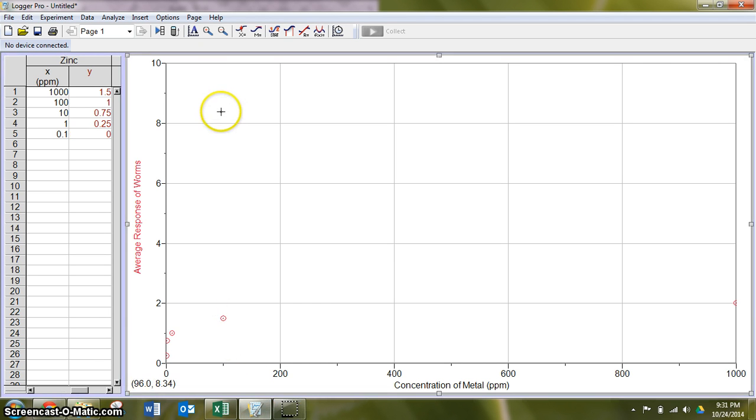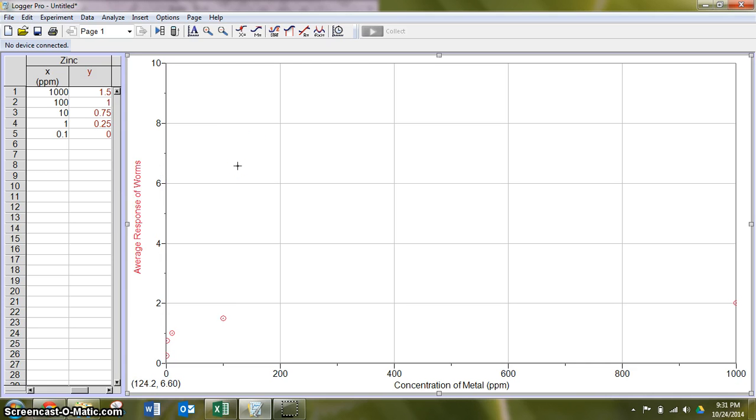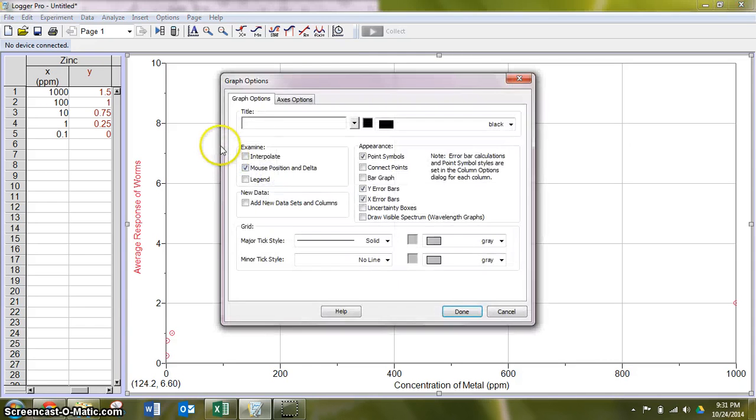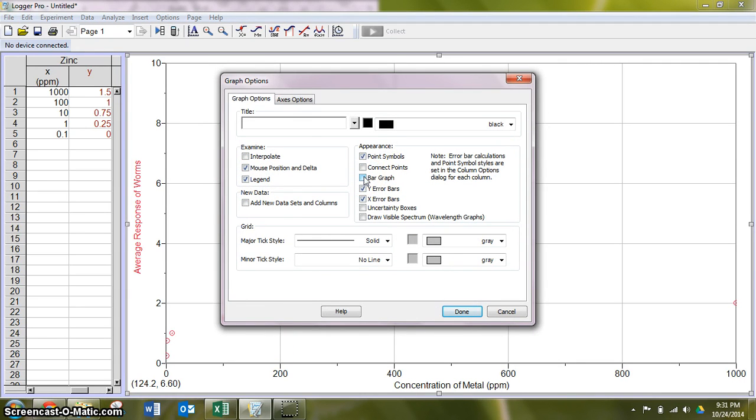Now, we want to go in and make a lot of our adjustments. Notice I put these in first, so we'll be able to do a lot of our button clicking. Right-click, graph options. We want our legend. We don't need a bar graph this time. We're going to leave it as the dots.